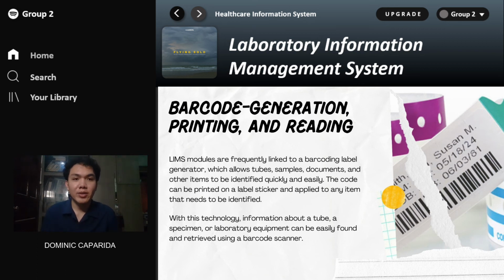As you can see in the presentation, this barcode generation, printing, and reading are not just for patient identification, but can also be involved with patient specimens, like test tubes of blood samples or other body fluids, tissue samples, or any laboratory tests.